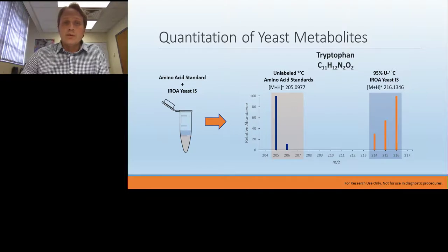And in this case, we also can then calculate the exact number of carbons. So for an unknown metabolite that we might not have identified through the various means, we can use the carbon-12 side and the fully carbon-13 labeled side as a third measure, because we still get the single isotope carbon-13 label as one measure, but as a third way to confirm the number of carbons in a specific unknown, which allows us to then do better formula prediction.